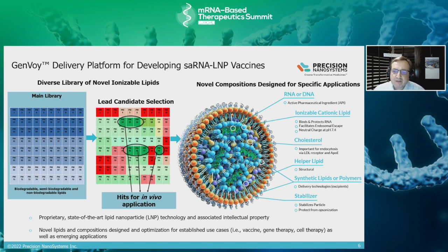particles. And you can see the complexity here of the lipid nanoparticle. They're typically in the range of maybe 60 to 120 nanometers in diameter. They can be sterile filtered, and they comprise the payload and helper lipids and the all-important ionizable lipid that enables encapsulation to take place through its interaction with the payload. It's positively charged at low pH, and it interacts at that point and binds reversibly with the nucleic acid that you're trying to encapsulate. Encapsulation efficiencies are typically greater than 90% of your payload. Your RNA is fully encapsulated in these particles.